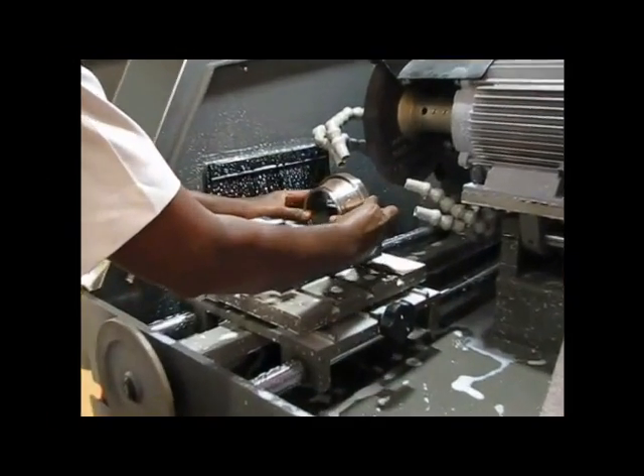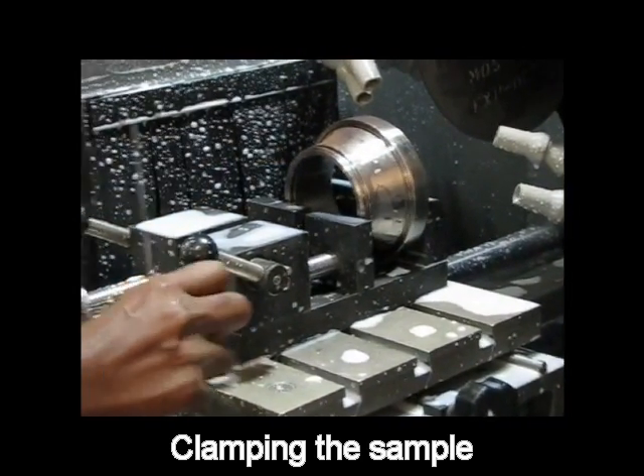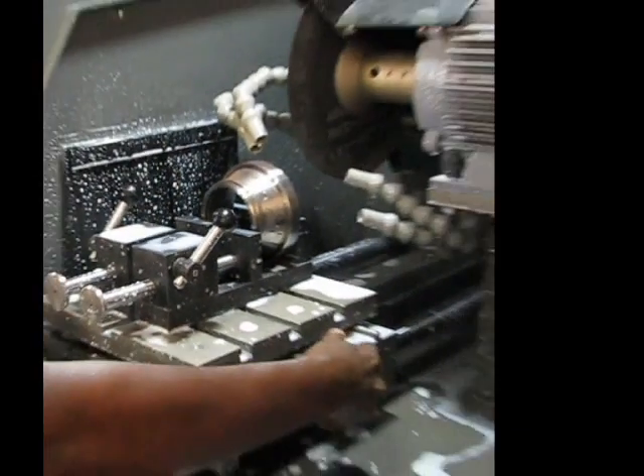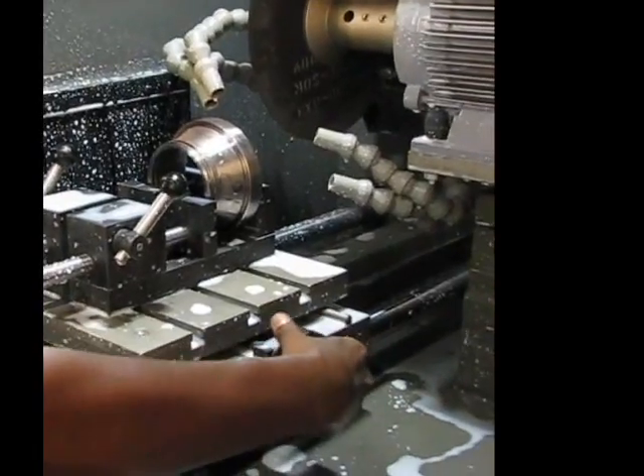The sample is being placed in the cutting machine. Now the sample is held in the clamp. This is the X movement, which is useful to fix the sample at the desired position.